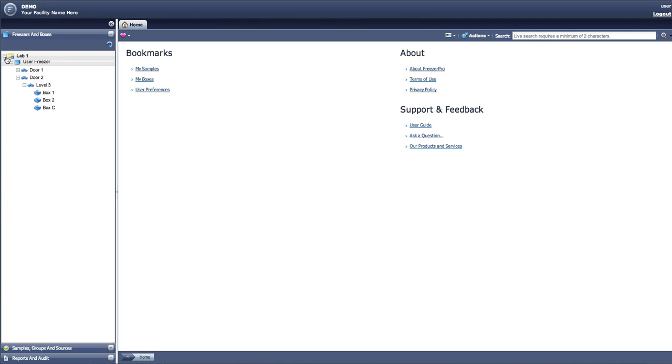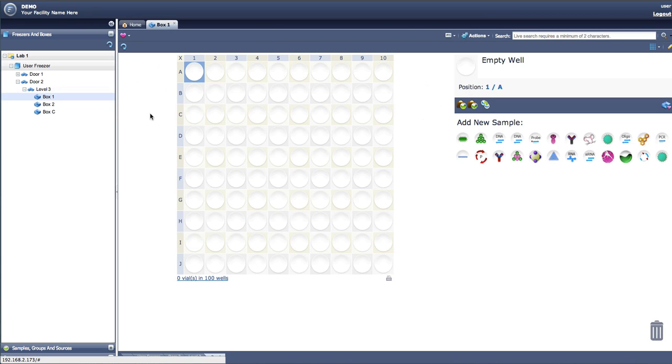There are many actions that can be performed when working with samples: creating samples, deleting samples, and editing samples, as well as changing sample volumes, copying and pasting samples, removing samples from freezers and restoring samples to freezers, setting sample alerts, printing barcodes for samples, adding samples to pick lists, pasting copies of samples as new samples, creating derivatives, and cutting and pasting samples to new wells and locations.